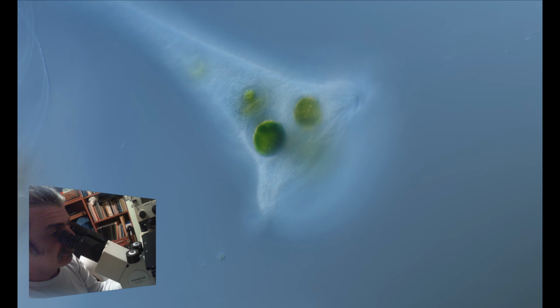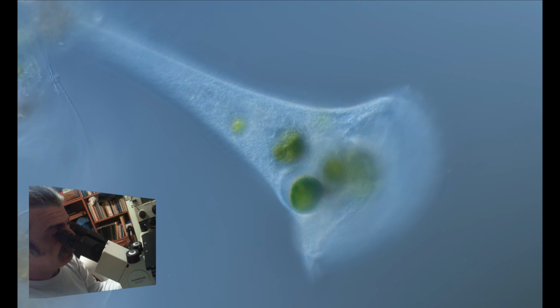Yeah, that's better. Now you can see its cilia. Yeah, it contracted inside the debris. Okay, we'll find some more.